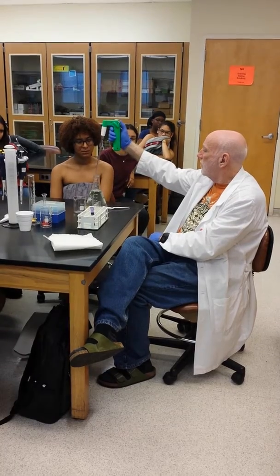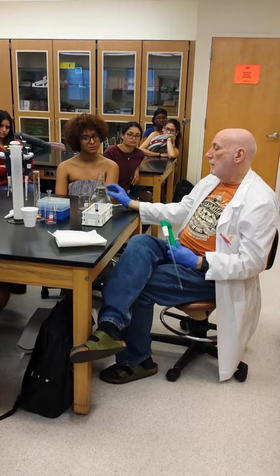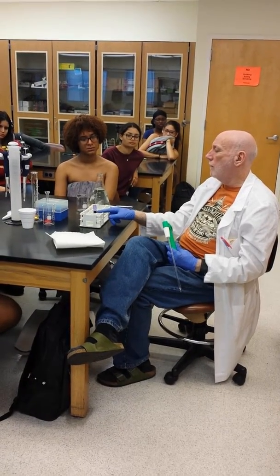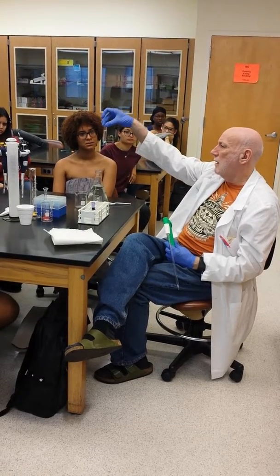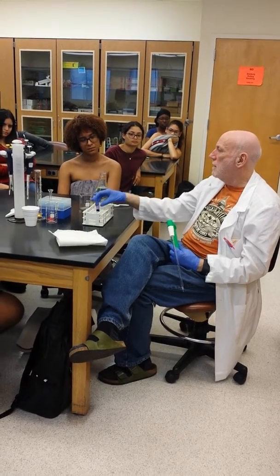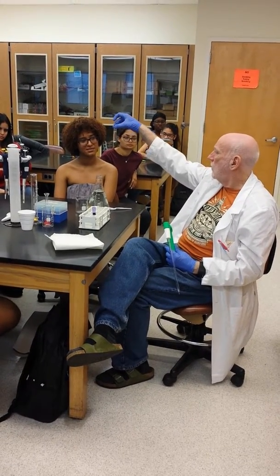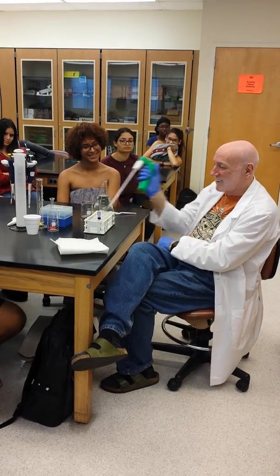Now here's the question I want you to think about. How much water do I need so I can dilute this concentration down to a 10% level? Right now it's 1 molar, and I want 1/10 molar. So how much water do I need here? Think about this. I'm going to take a little bit of this and put it into here. Anyone want to guess how much water I should put in here? 10 drops? No. 10 something. Yeah, that's a safe answer.